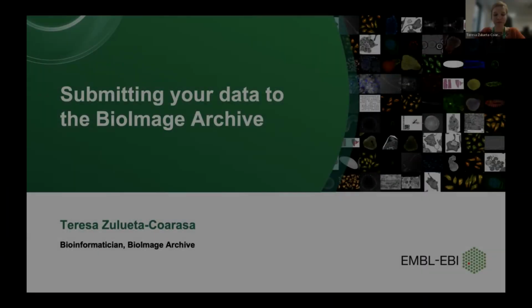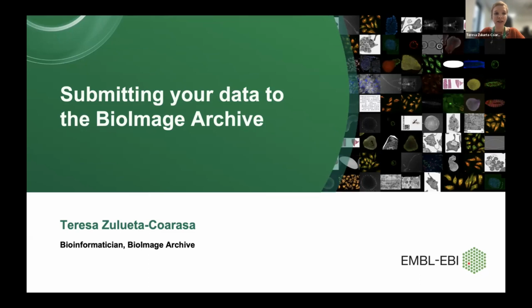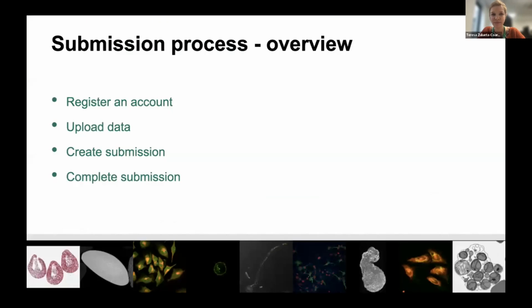I'm Teresa, and I'm a bioinformatician at the BioImage Archive, and I'm going to tell you briefly about how to submit your data to our repository. So Ibuke has already explained how to organize your data for your submission. So I'm just going to go through the practicalities of it. So first, you will have to register an account, then you will upload your data, create a submission, and then the submission will be completed.